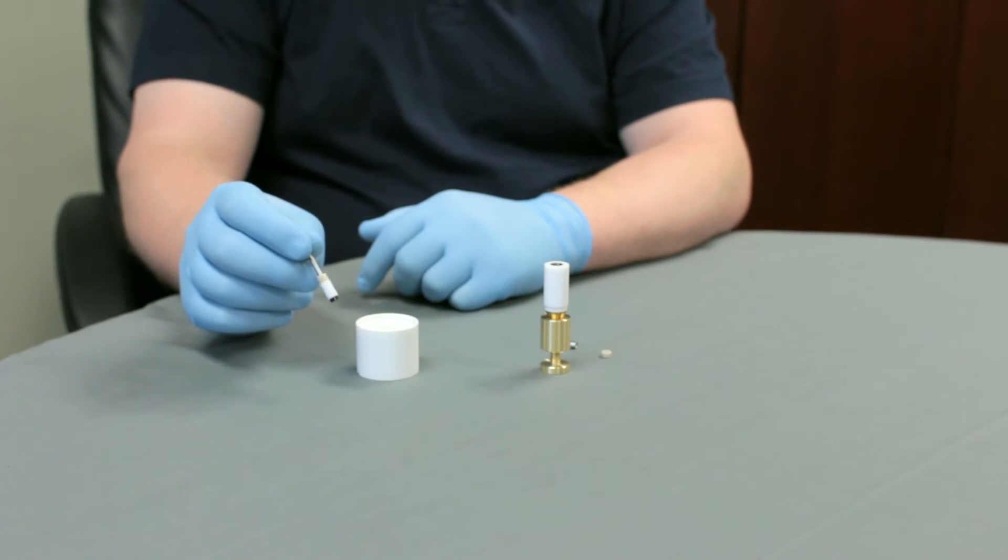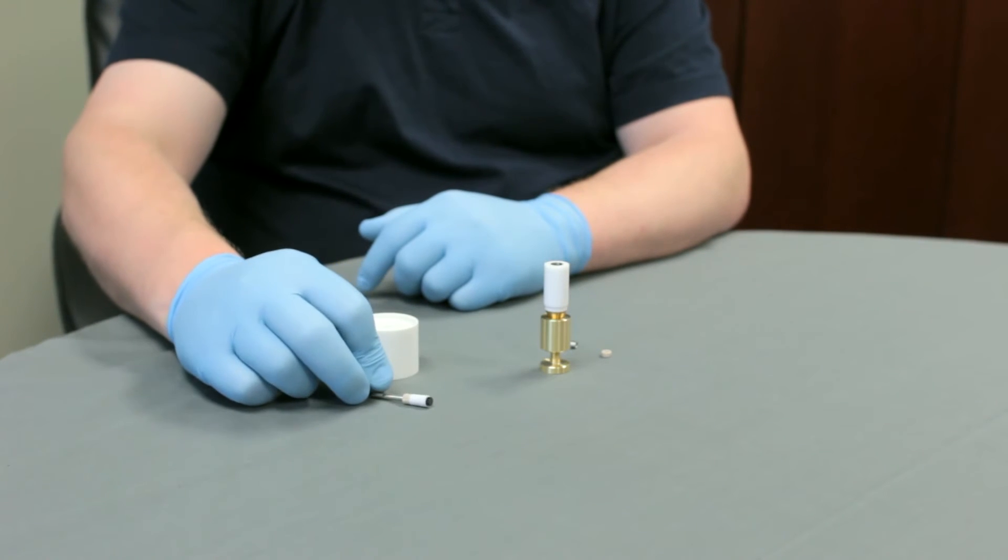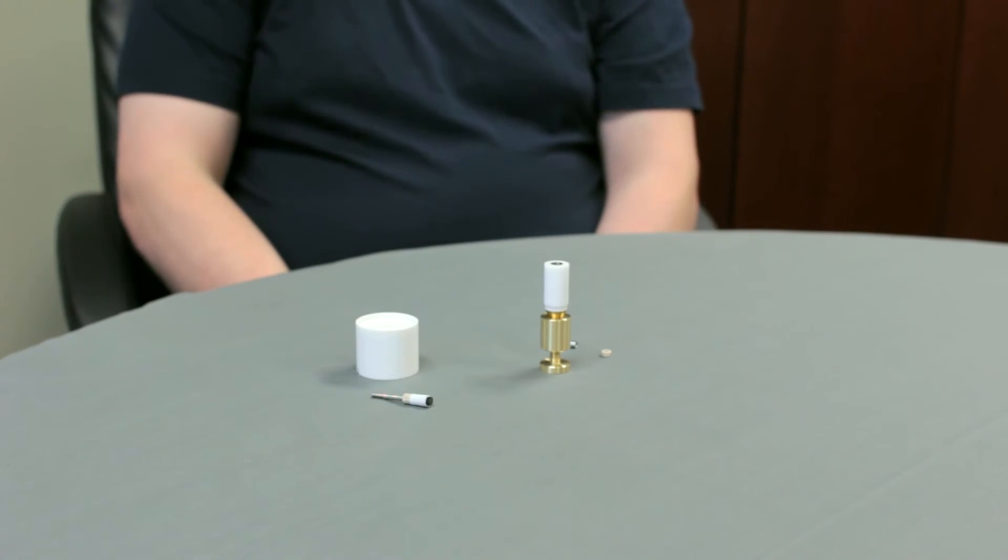If the disk insert falls out, then you need to replace the U-cup. Make sure that the disk insert can be picked up without fail using the new U-cup assembly.